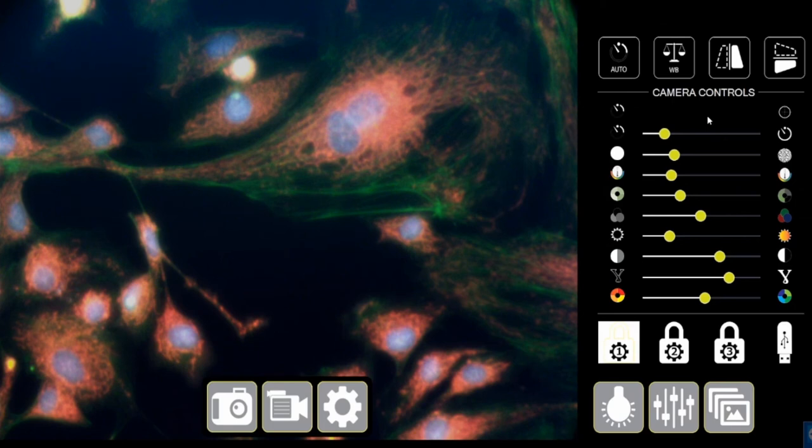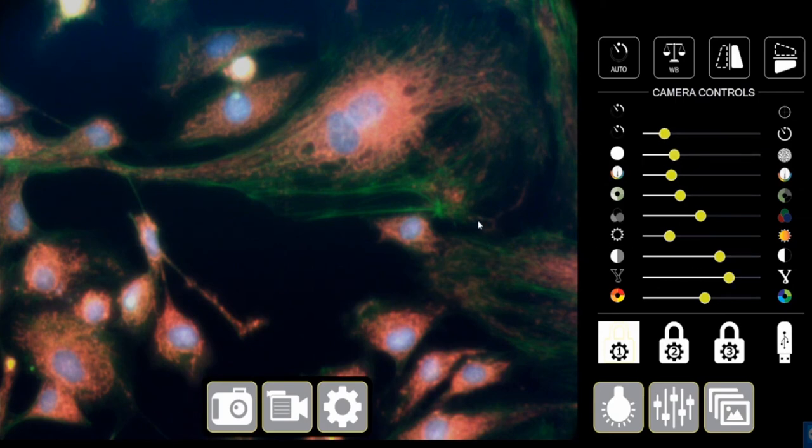So this could be a good starting point and then you can fine adjust the image further. So that's how easy this software is. This is extremely user friendly and the output is in front of you.